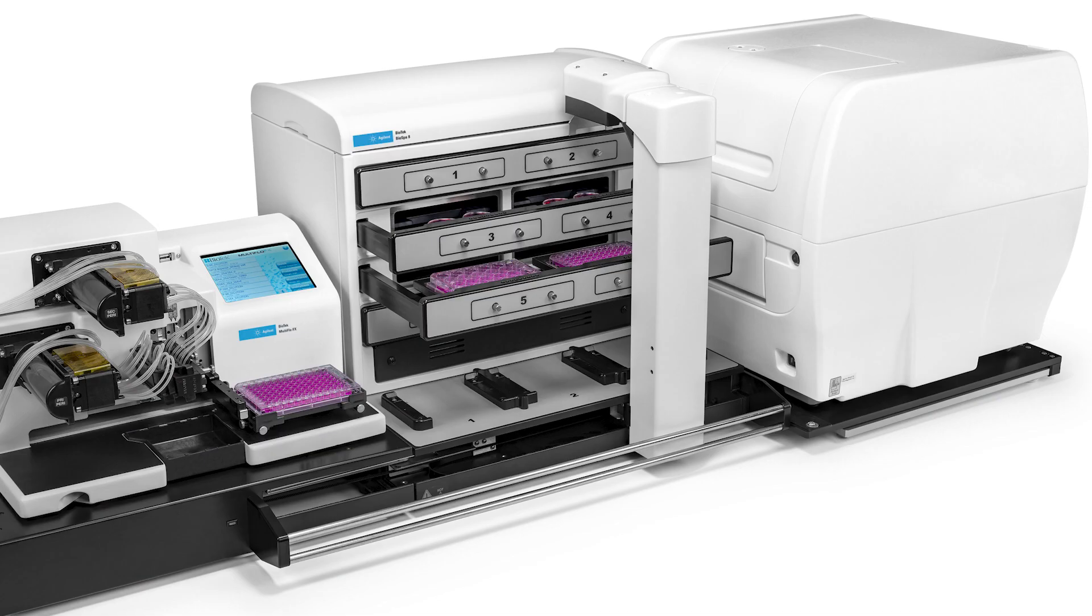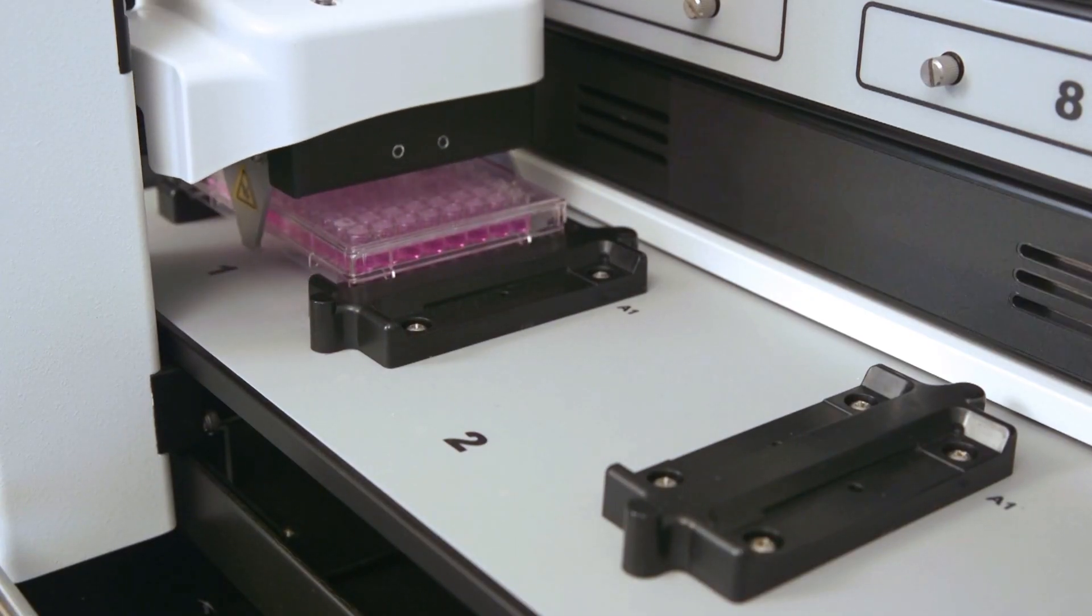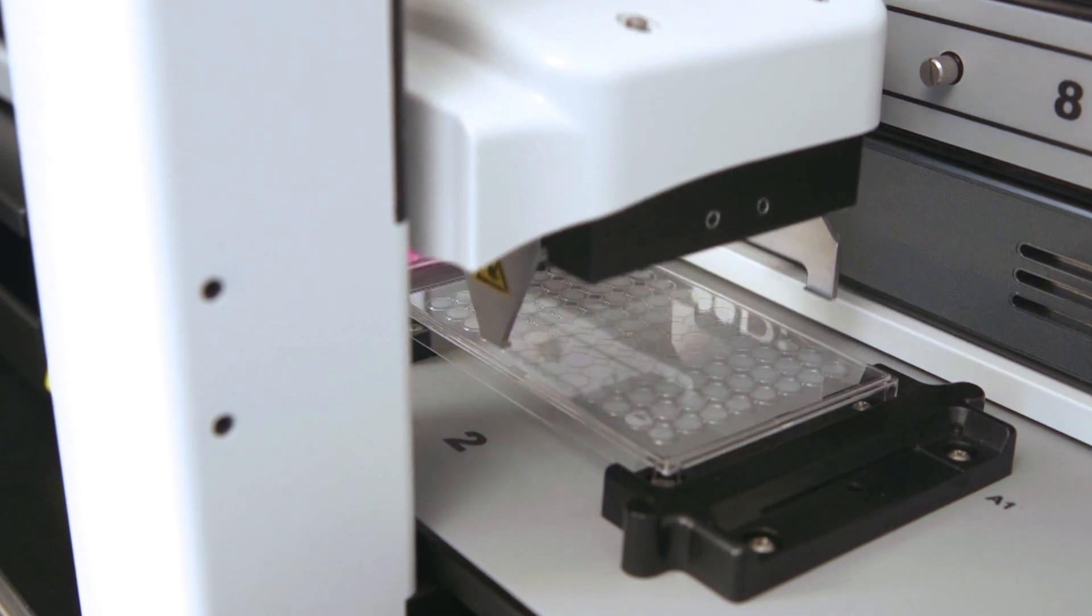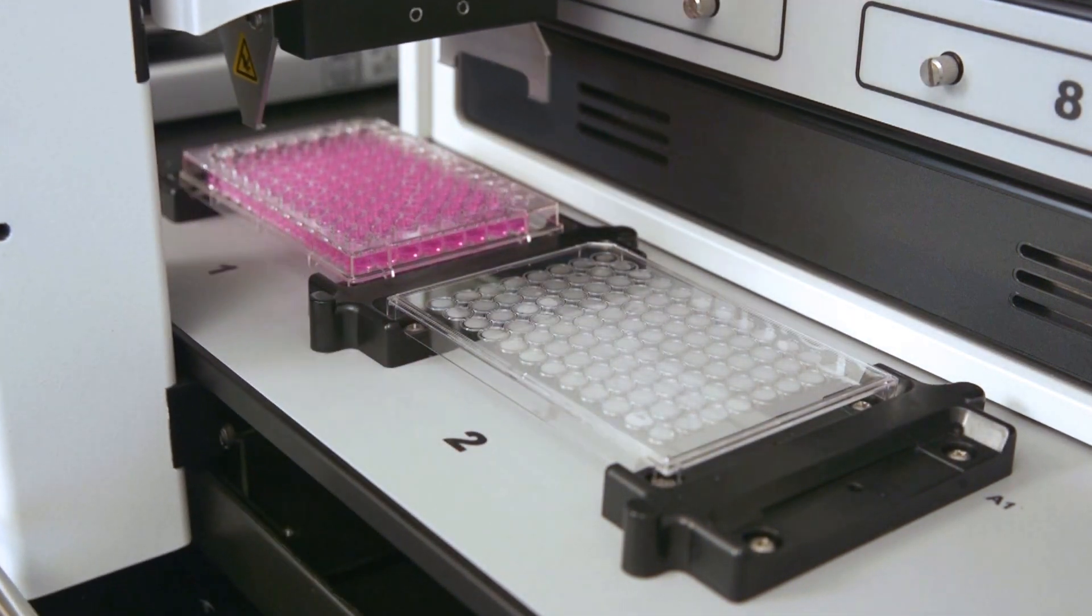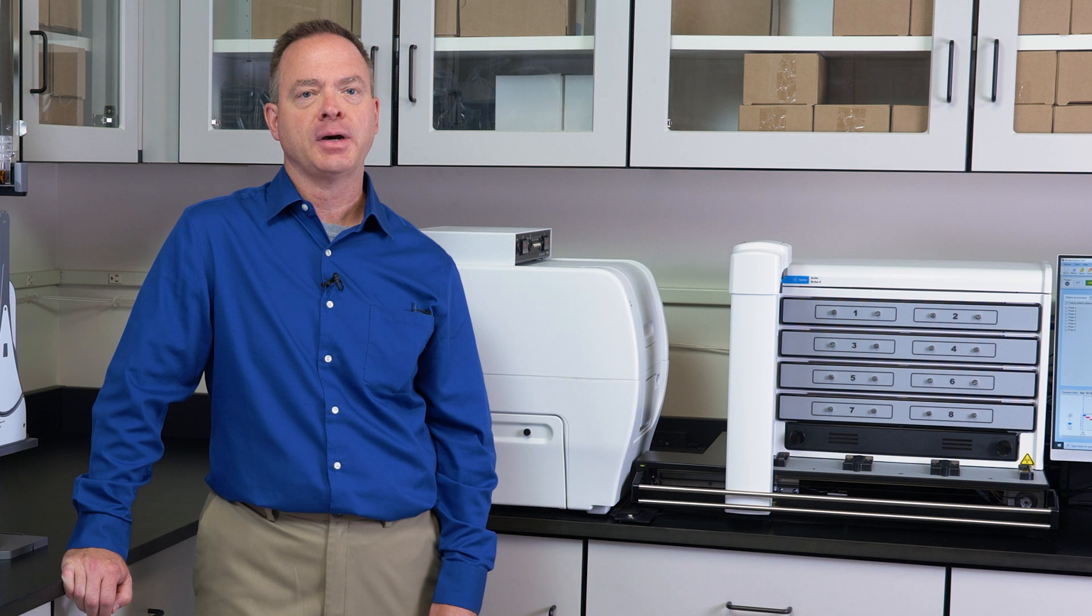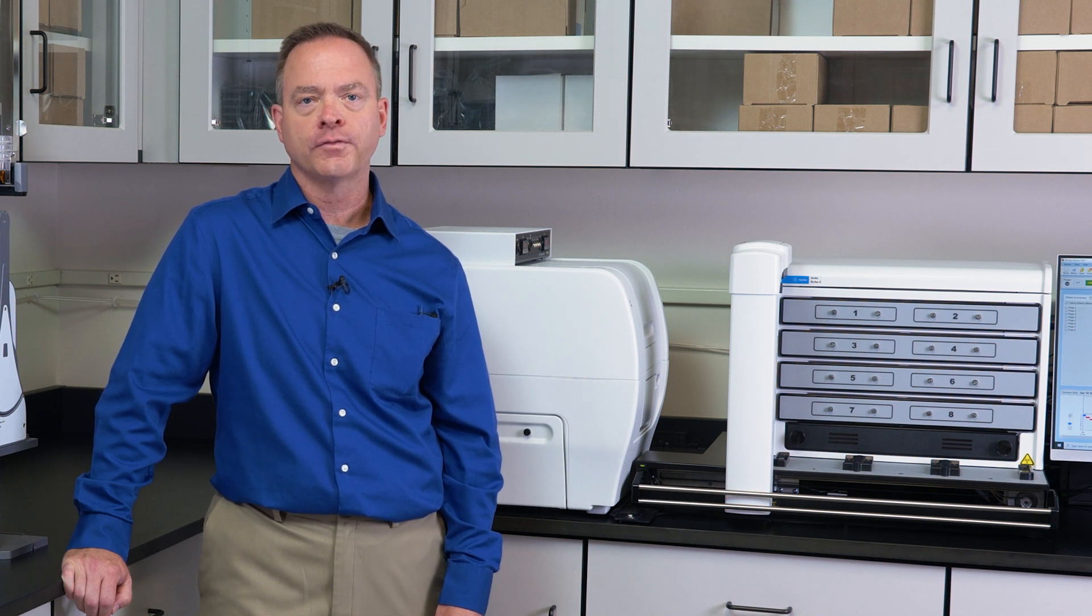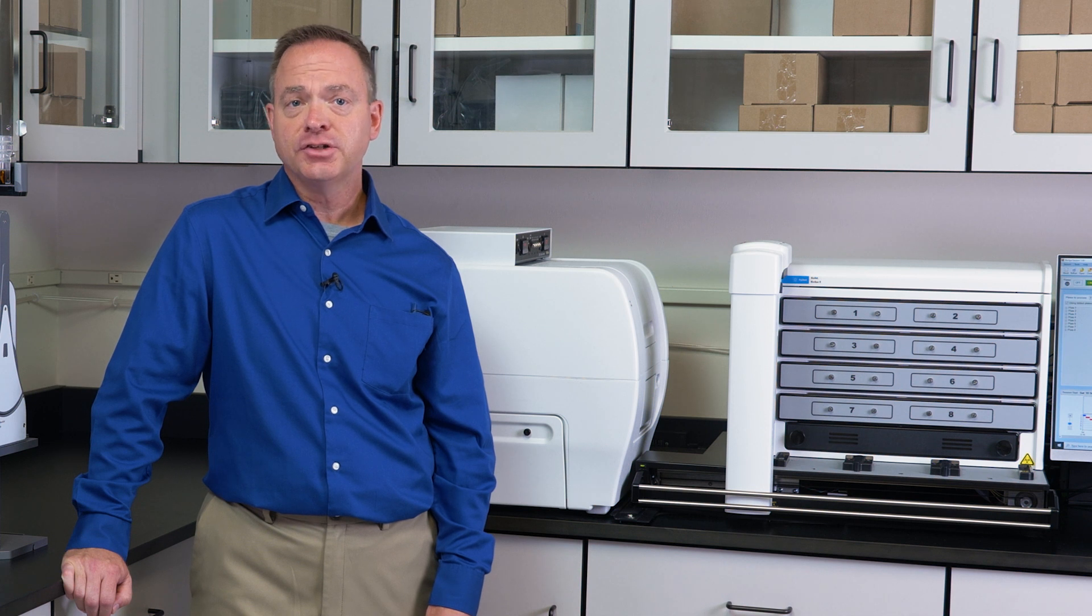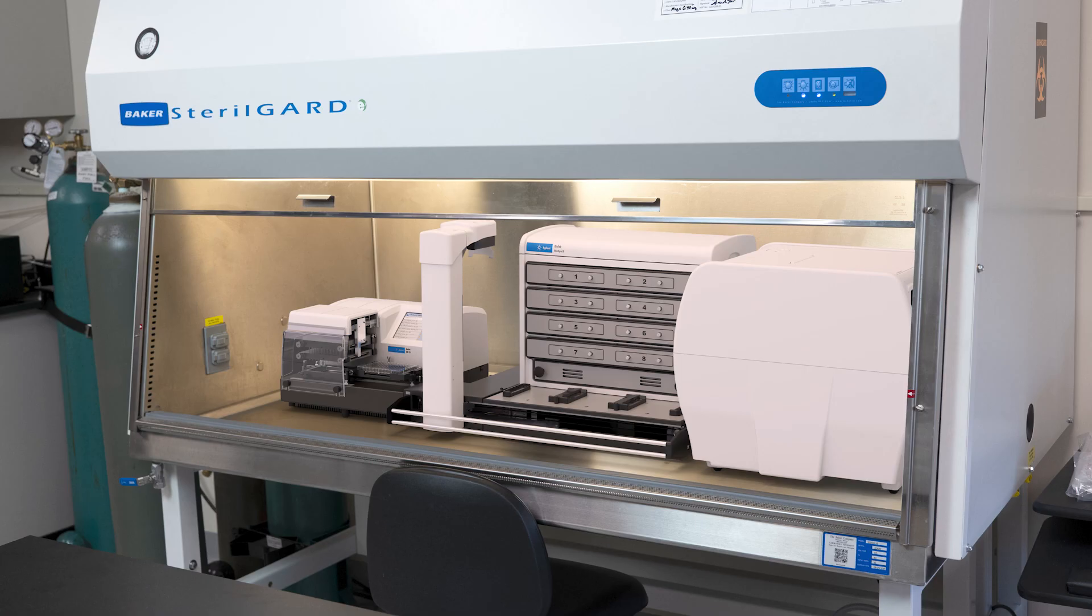Plates can be delitted by the arm before the liquid handling procedure and then relitted before being placed back into the BioSpa or transferred over for reading or imaging. This combination is still small enough that all three instruments can be easily placed into a laminar flow hood for sterile processing.